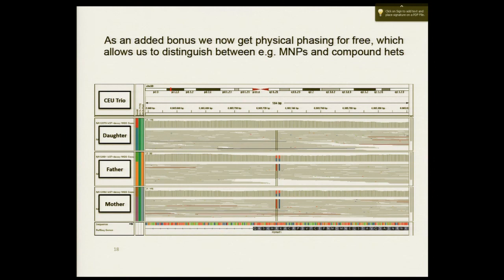Is this making people nervous that it's an MNP? I'm just surprised. Because of course, if you wanted to, you could output it as 2 SNPs. I just think you would get the wrong answer then. Most people would do the wrong thing with a VCF file that had 2 SNPs.